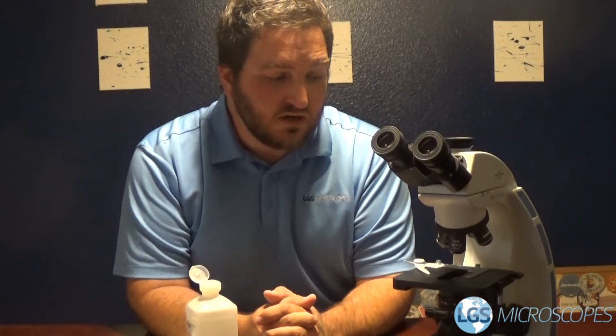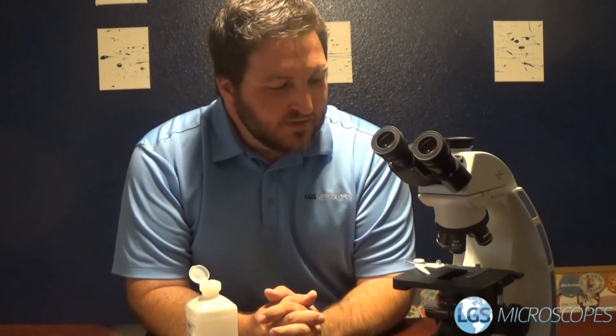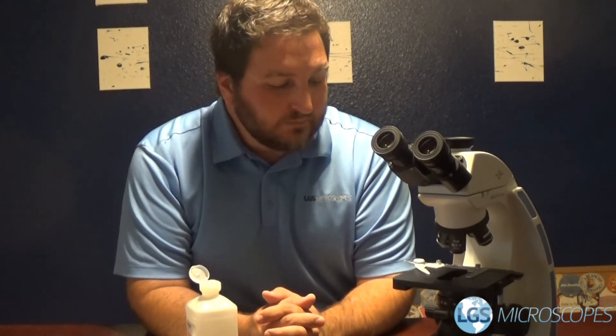Anyway, if you do this however often you feel is necessary in your clinic or your practice, you probably know better than I do. But it's just good practice — maybe once or twice a day, or maybe even more often than that. This is also just a really good way to keep your microscope clean in between cleaning the actual optics.